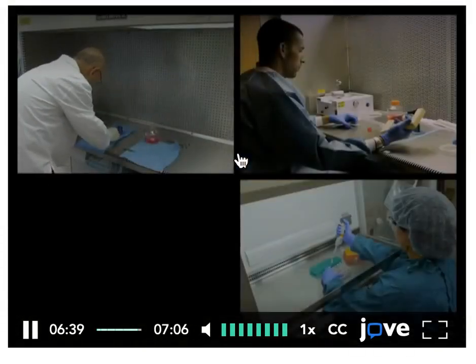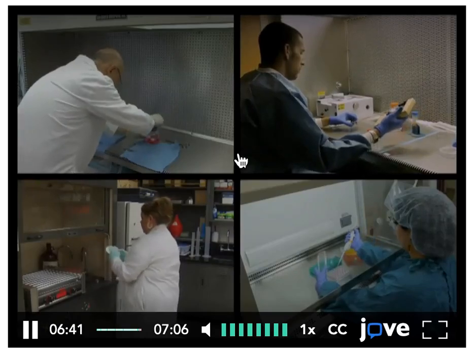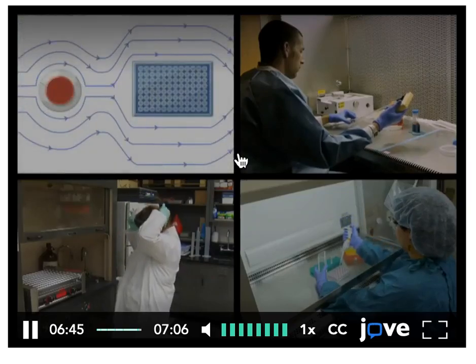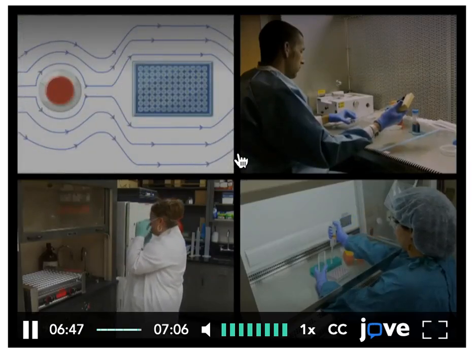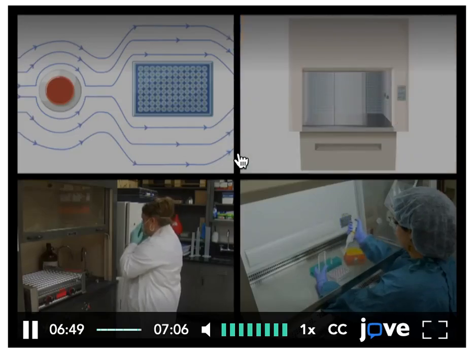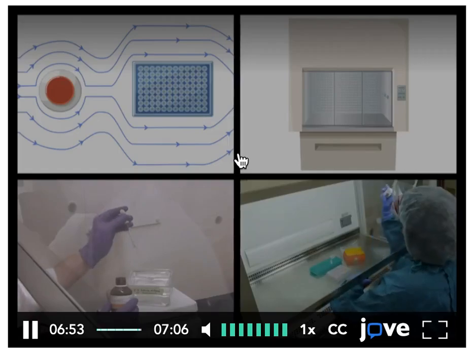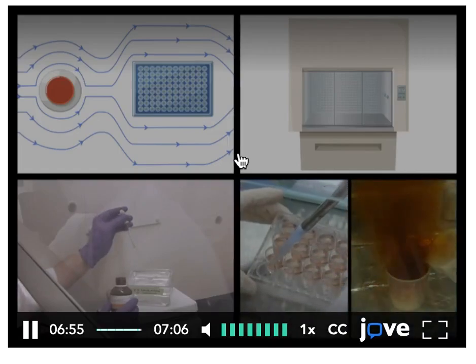You've just watched JoVE's introduction to working in the hood. In this video, we talked about the principle behind how a hood works, or laminar flow, the components of a typical hood, how to work within the instrument, and different hood types.